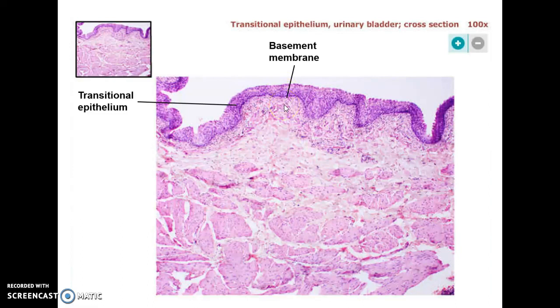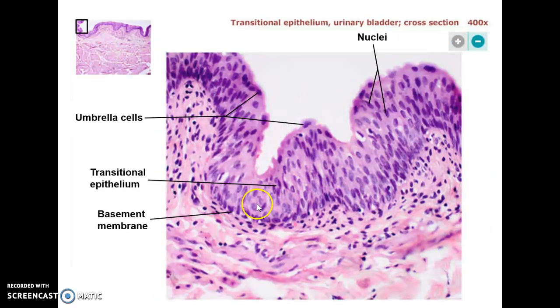This is the transitional epithelium cut through the wall of the bladder — a lot of muscle cells down here, a fatty area that supports blood vessels and nerves, and then here's that transitional epithelium on the inner surface of the bladder. You can see it up close and it just looks like a whole bunch of cells jumbled on top of each other. Remember, this is a bladder that's deflated and the wall is all crumpled up, and the cells are kind of jumbled on top of each other.